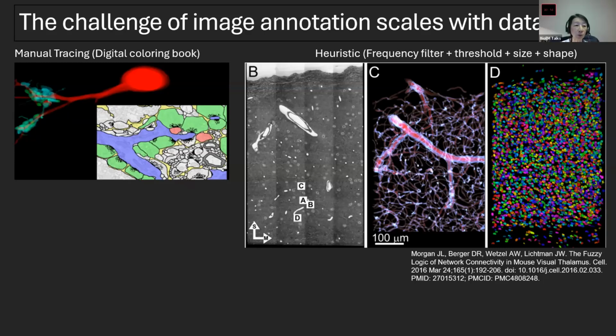So that means some tiles will have poor quality, but some of them are okay. Yeah, and usually we'll have some sections of kind of borderline quality, and you have to decide at what point you retake the image versus go ahead with it.